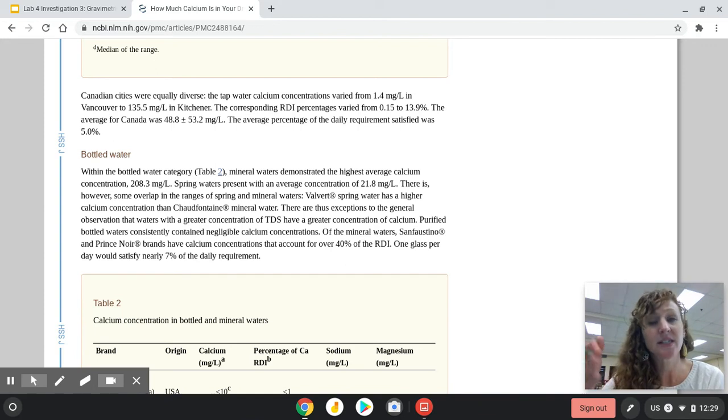And so we could start with that amount and convert to how much sodium carbonate we would have to add in order to precipitate all of that out. So why don't you go ahead and do that way, or you can do the trial way. You need one of those two methods in your procedure.